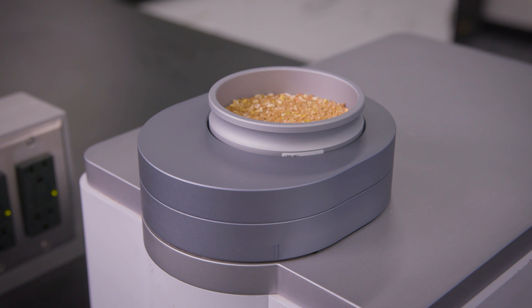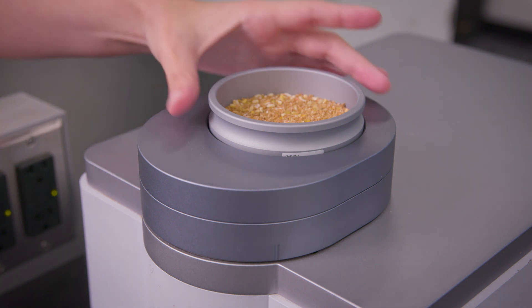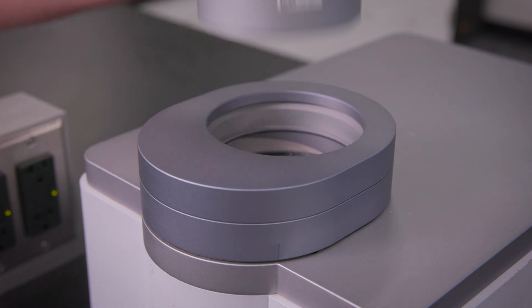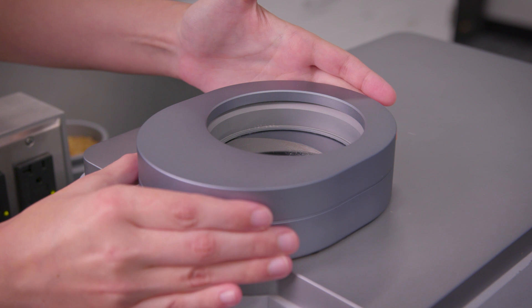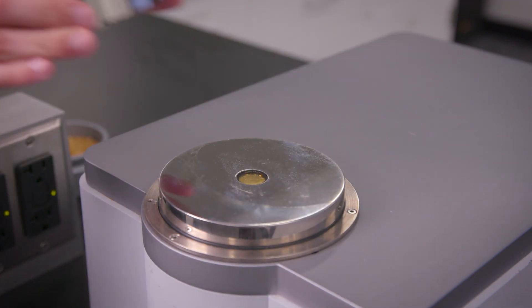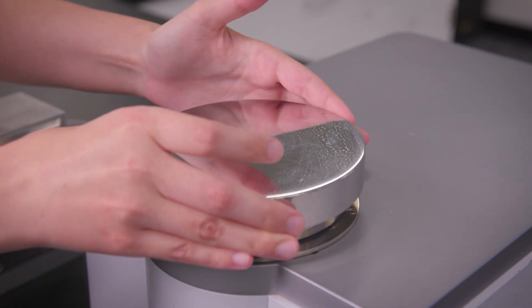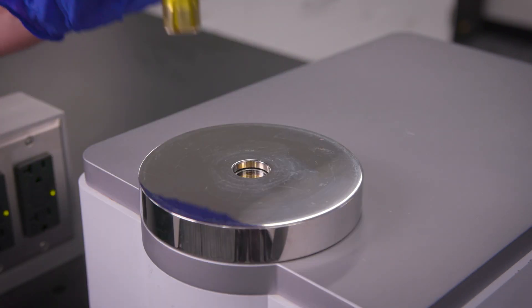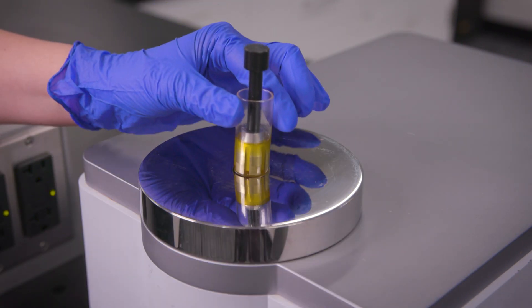We know it takes two to tango, but do you know about the great duality the Tango offers? We can measure dry and feed ingredients such as our meals on our integrating sphere, and with the simple change of an accessory we can now assess high energy sources such as our poultry fat here.